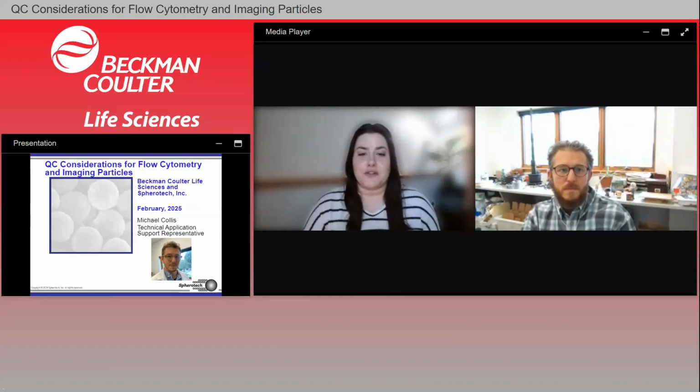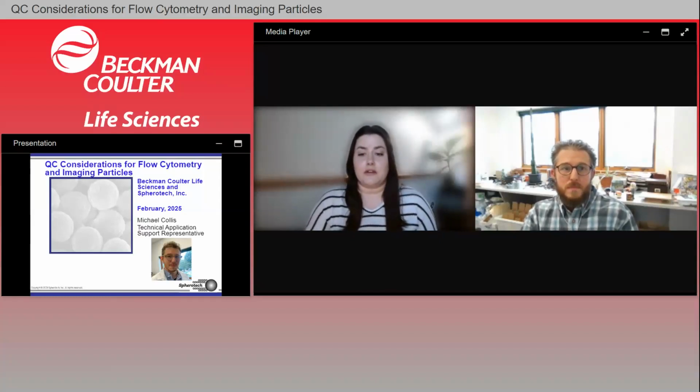I'll go ahead and ask our first question here. This question says, since ERF values depend on a flow cytometer's spectral filters, how is this accounted for when using the ERF beads mentioned?